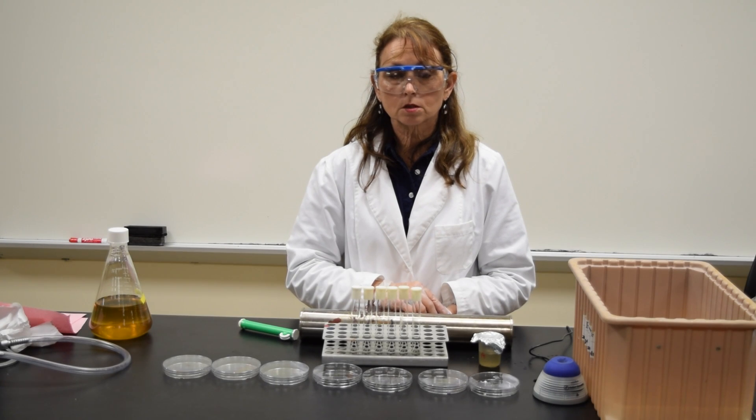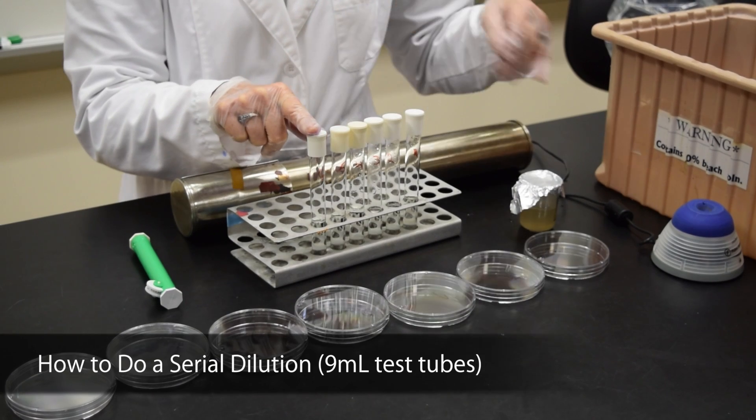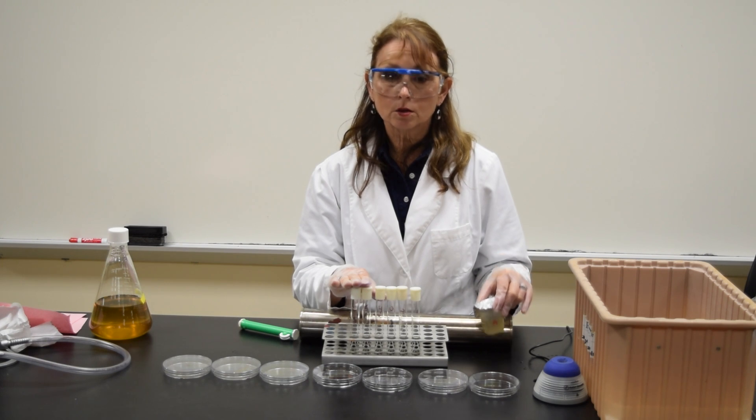The purpose of this demonstration is to show you how to do a serial dilution using 9 ml test tubes. In this case, we're going to be diluting out sponge water. I start with my sponge water, which is at my 10 to the 0 dilution.